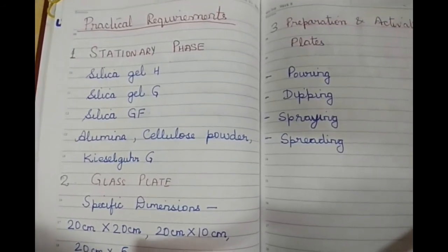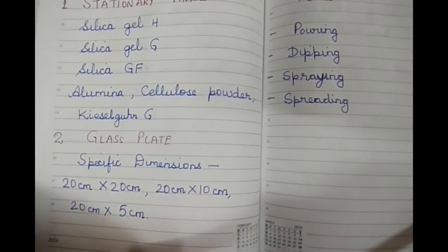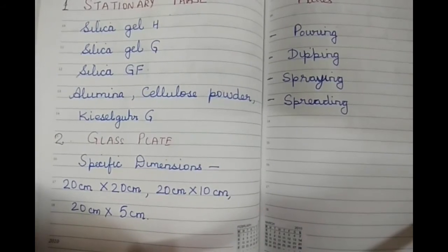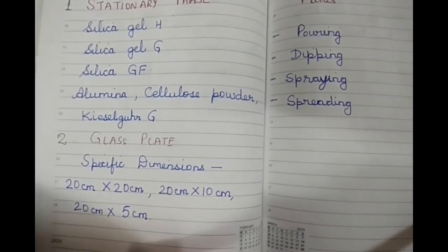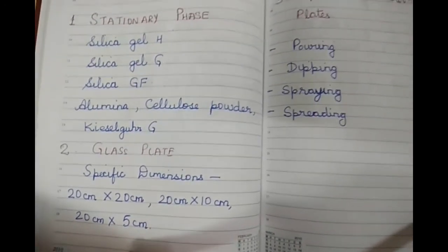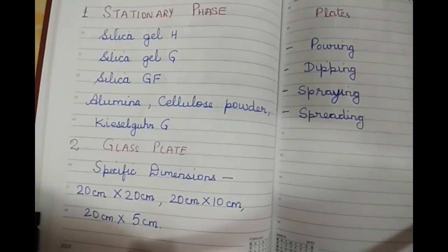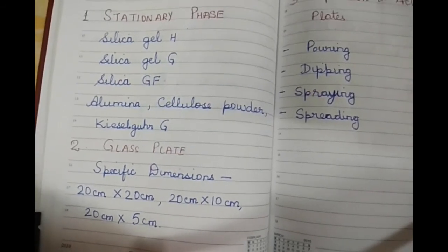The second is glass plate. The glass plate has specific dimensions, which is 20 cm by 20 cm. It can be 20 cm by 10 cm or 20 cm by 5 cm. Then microscopic slides can also be used. Plates should be of good quality and withstand high temperatures.